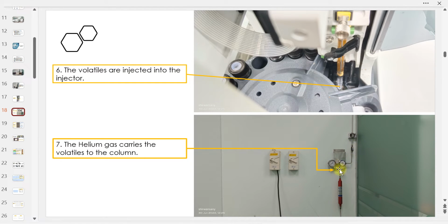But this one helium punya gas. Untuk in our lab, the helium is located outside of the building lah. Dekat luar, dia ada cage lah. Yang tadi, dekat atas kan, dekat sebelah GC tu. Kalau bertahan, selalunya satu tank tu boleh tahan setahun. Tapi ikut how many times lah you run. Kalau kerap, helium tu akan cecah 1000 lebih. 1000 hingga 2000 saja. So kalau pakai sikit selalunya tak ada masalah. Okay.